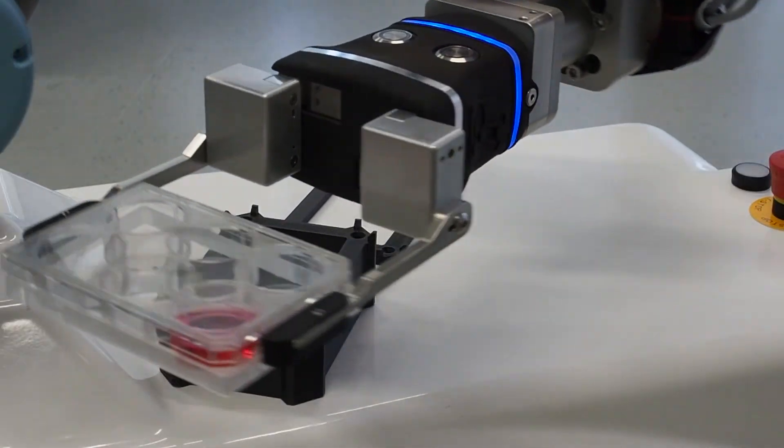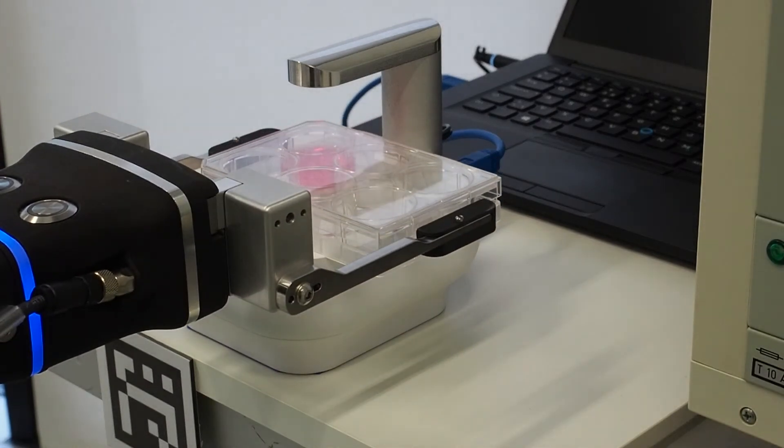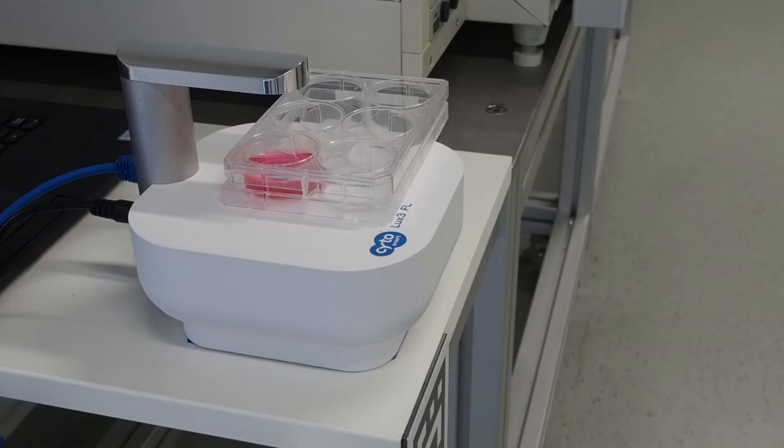The plate is placed on the Cytosmart Lux 3FL for imaging. The green flash is the Cytosmart Lux 3FL capturing an image and the cell confluency algorithm instantly calculates the value.